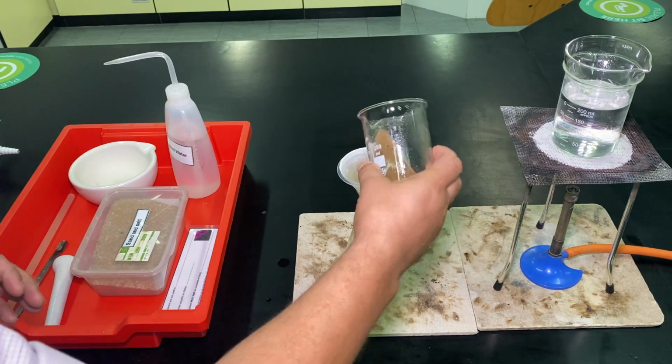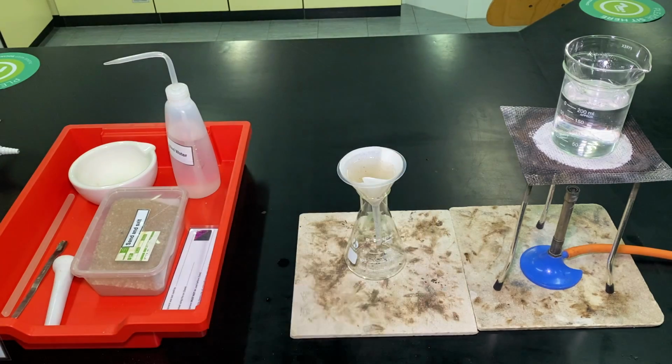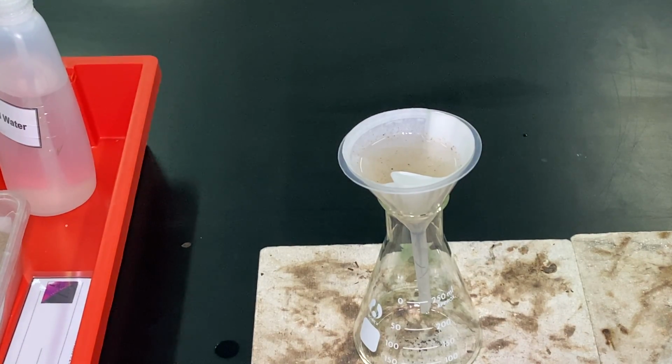Just a little bit more. Want to be a bit careful. Don't want to pour all the sand in, because that's just going to clog up the filter paper and the filter funnel. I'll zoom in for you. As we can see, it's a slow process, filtration, but it's definitely coming through.